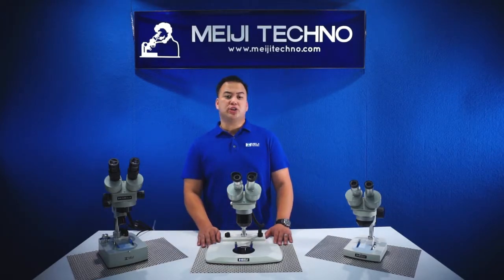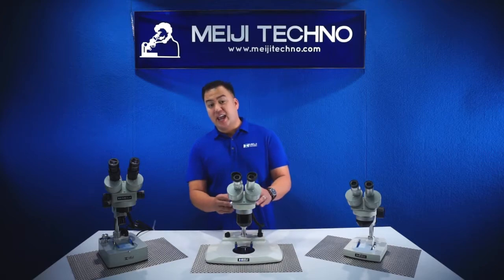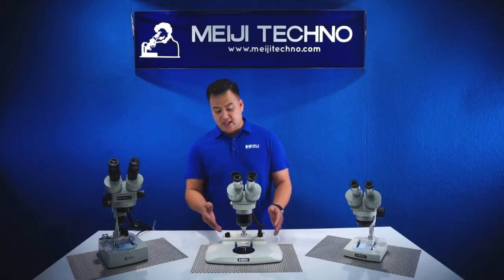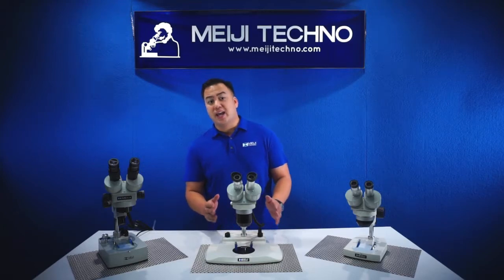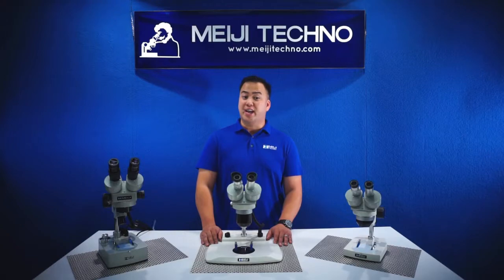Its modular design enables the user to engineer his or her custom solution for virtually any application, selecting components from the widest range of stereo bodies, stands, eyepieces, auxiliary lenses, and illuminators, and a variety of accessories available in the microscope industry today.